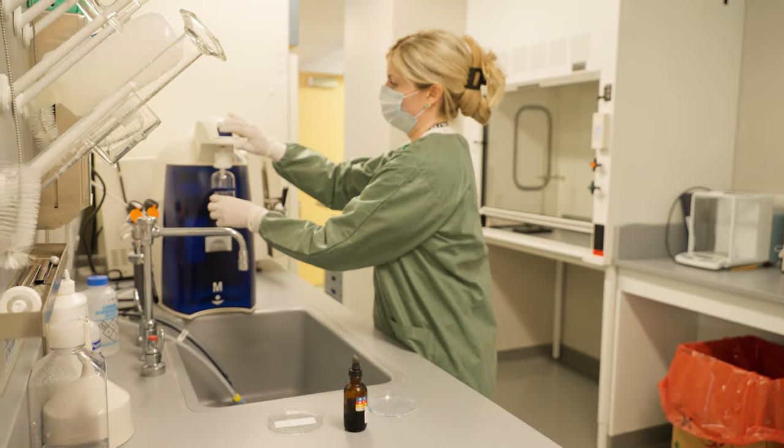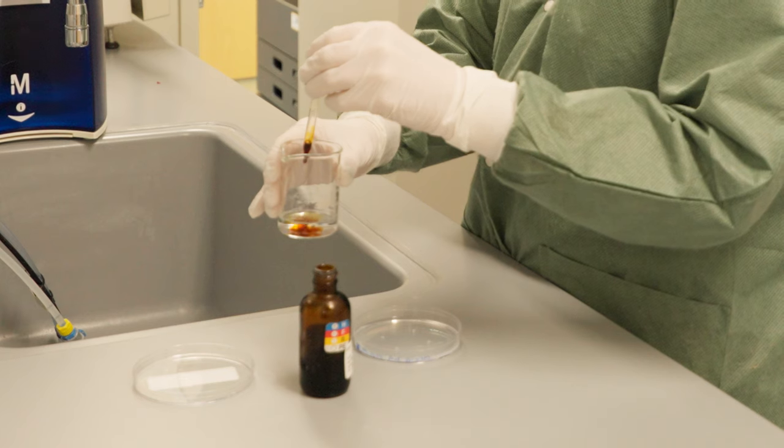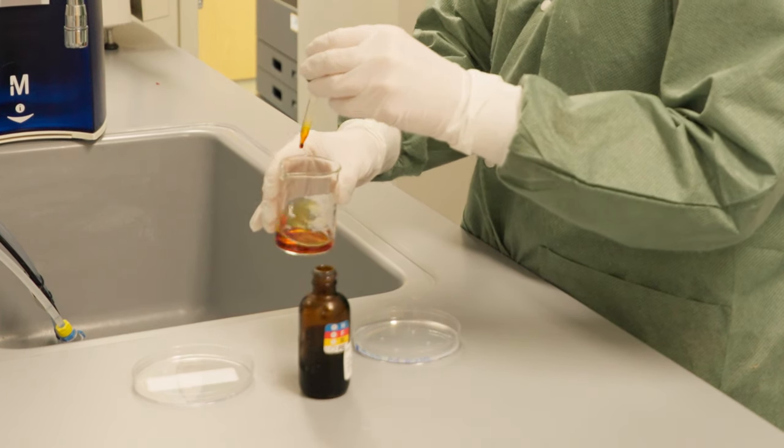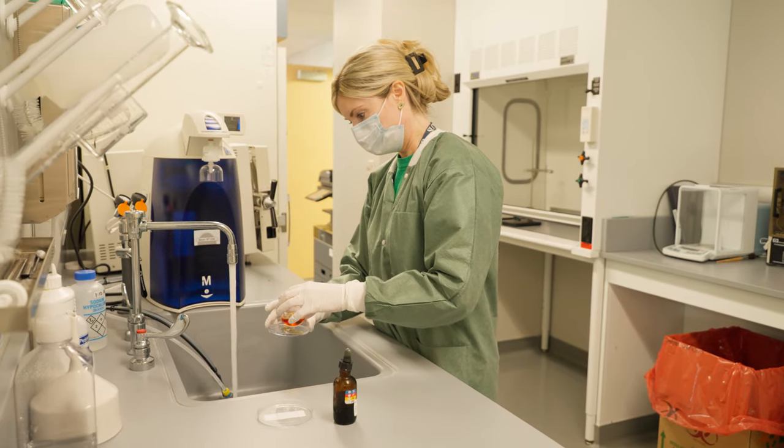The plate is then stained by pouring a dilution of saturated iodine solution over the gel surface and then rinsed with water.